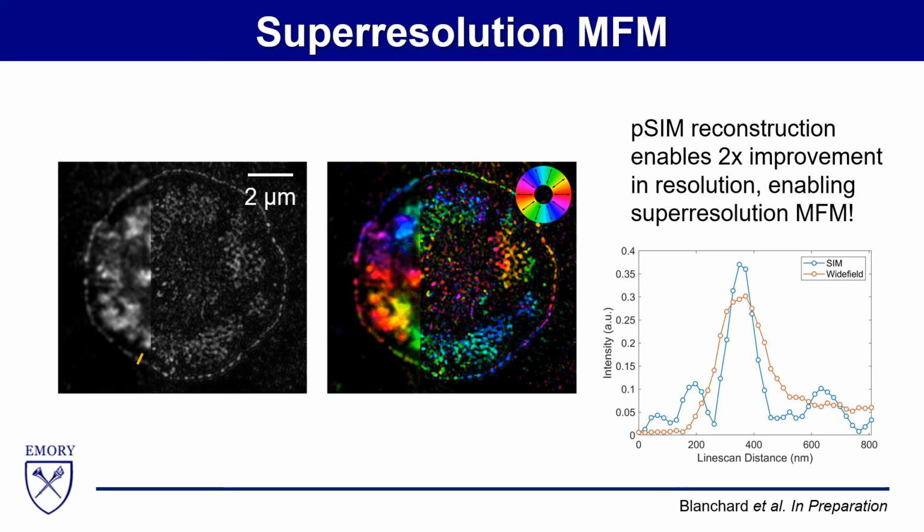So here's a bigger view of that same platelet, shown in both wide field and super resolution. We were able to run these images through a SIM reconstruction algorithm developed by the Shi lab to obtain a super resolution tension image and a super resolution force orientation map. We're trying to be careful about how we analyze the super resolution data because it's known that SIM reconstructions can introduce structural artifacts. But we do want to note that if you look at a simple, well-defined structure within the cell, such as the lamellipodial ring on the bottom left, you can clearly see a narrow two-fold resolution enhancement.